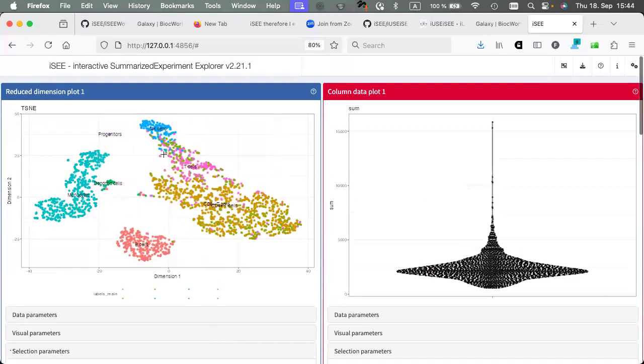So I want to capture something which is not possibly the most rectangular selection. So it can be a concave selection for whatever reason, but you can select this by brushing in a very clunky manner, but still works. And then you can have that.